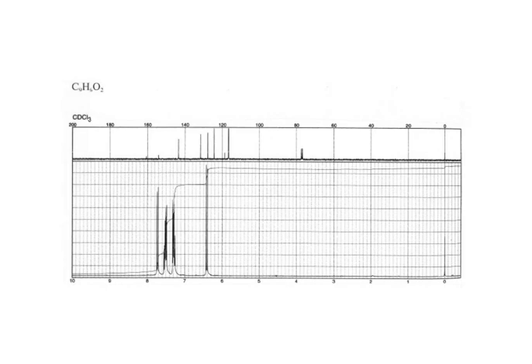This one has a C13 up here, if you can see it, and the proton down here. That C13 is pretty small. But you don't need that. You don't even need that? Yeah, you have the proton. Well, there might be things that you can get from the... Yeah. Oh, that's not even that one. There's at least 4. I'm officially too far away to read that.